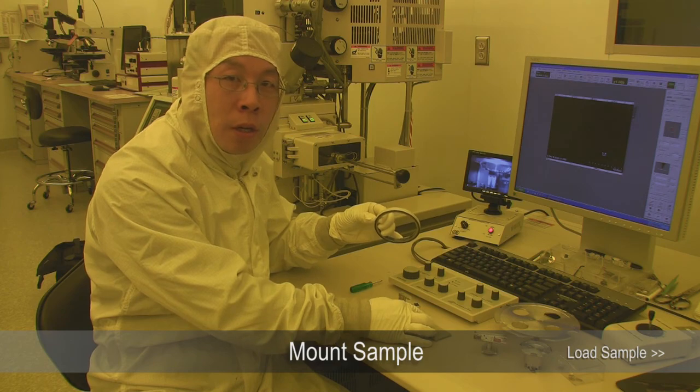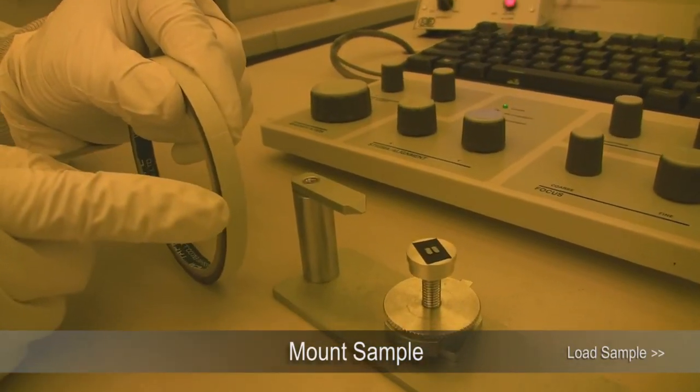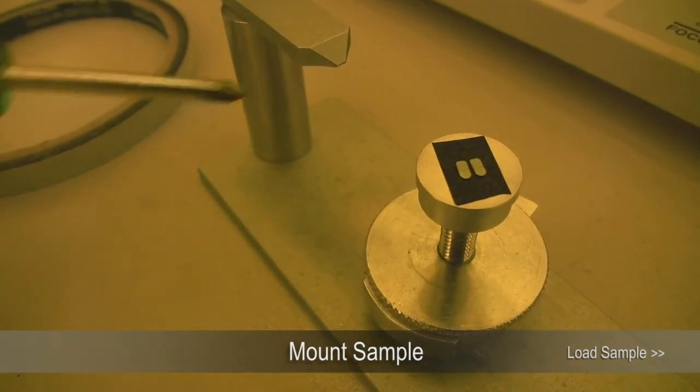So we have a roll of carbon tape here. Cut a small piece of the carbon tape, place it on the sample holder, and then put your sample on there.